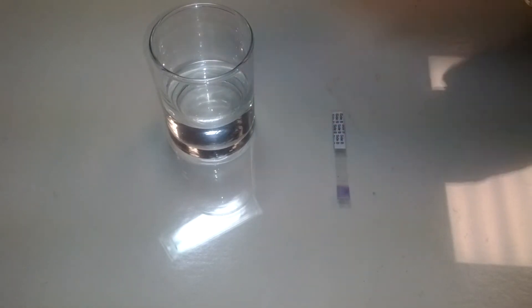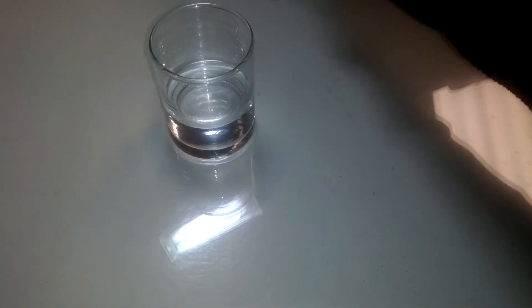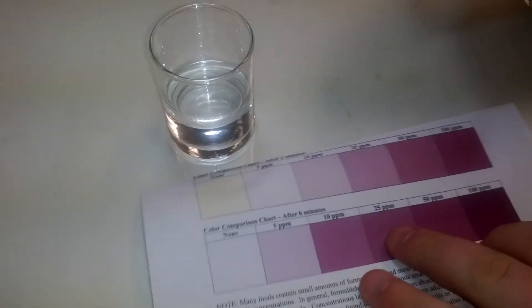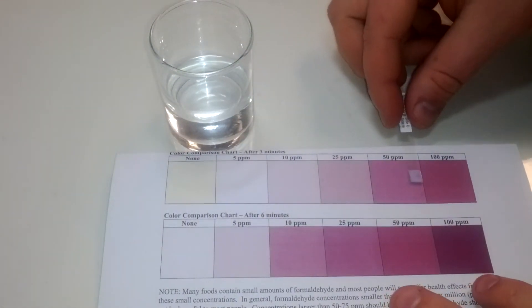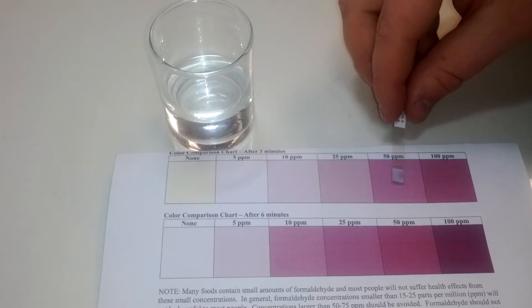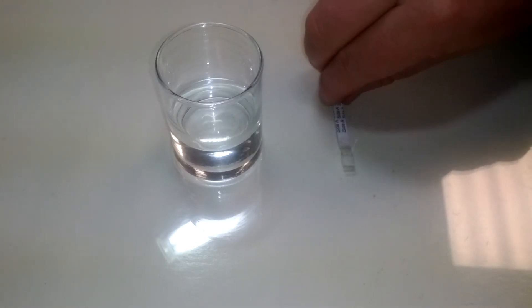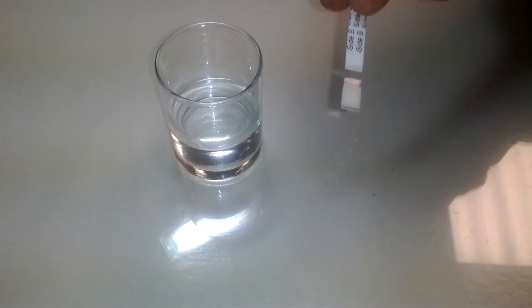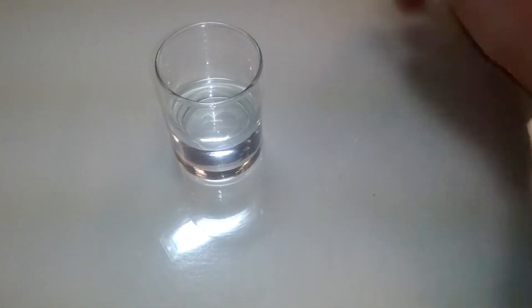After the time has passed, turn the detector over and view the color formed on side B. Compare the color formed to the printed color reference. If a pink or purple color forms, it indicates the presence of formaldehyde. If only a yellow color forms, it indicates that there is no formaldehyde present in the sample.